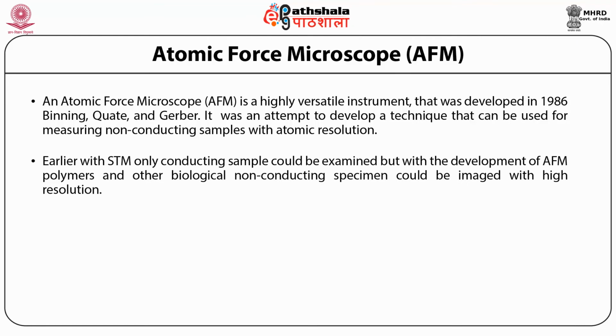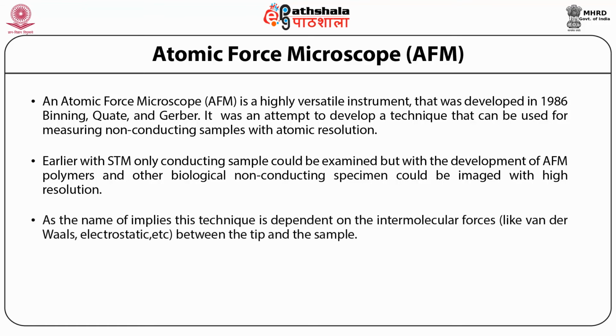Earlier, with STM, only conductive samples could be examined, but with the development of AFM, polymers and other biological non-conductive specimens could be imaged with high resolution. As the name implies, this technique is dependent on the intermolecular forces, that is, van der Waals, electrostatic, etc., between the tip and the sample.